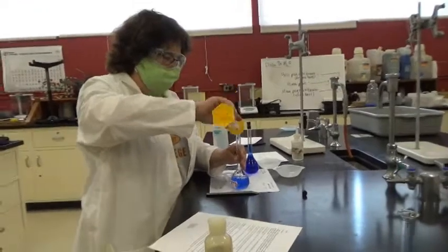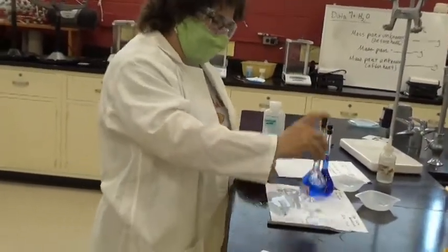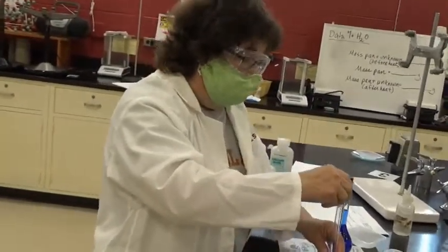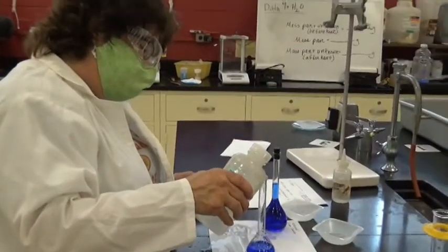I can smell that ammonia, although I can't through the mask quite as easily. I'm close to it, that's why. Now, diffusion. I'll swirl it around a little bit. These particles were much smaller. And I'm going to, again, put some water in it until I get to the bottom of the neck.